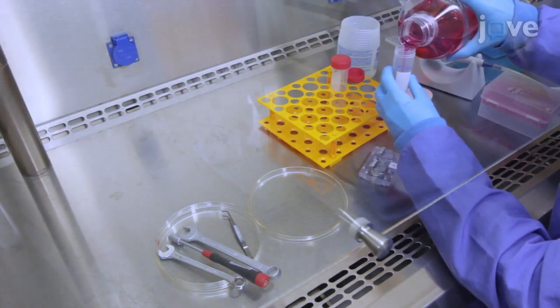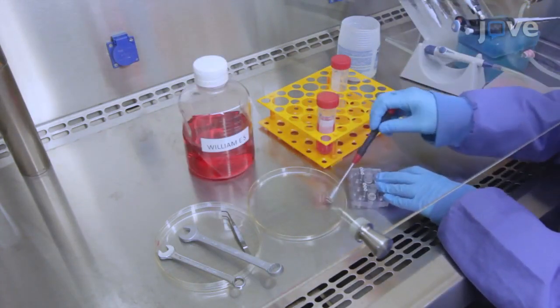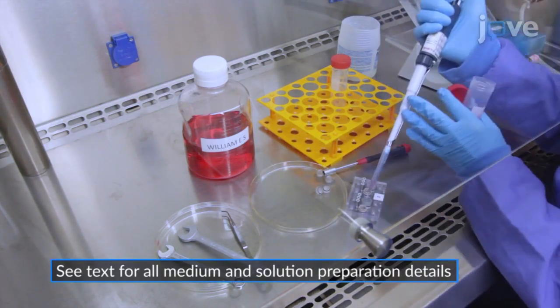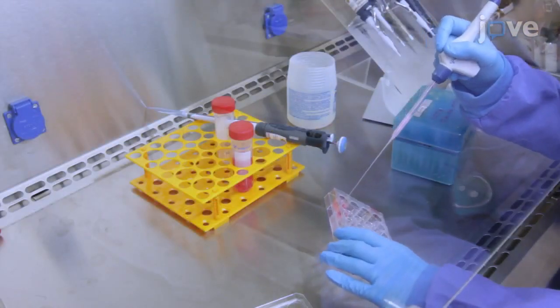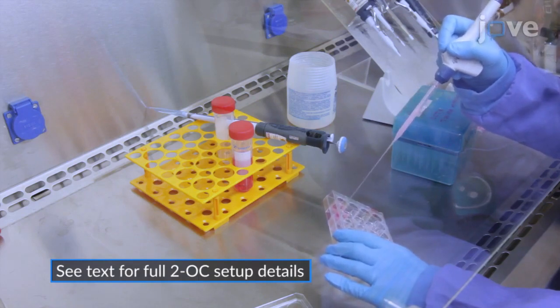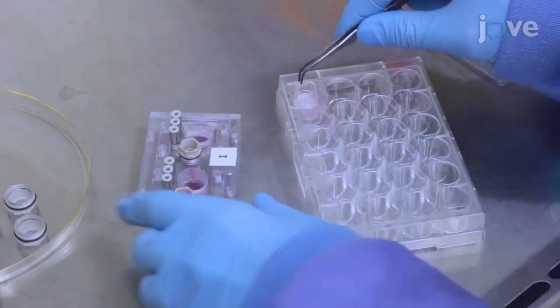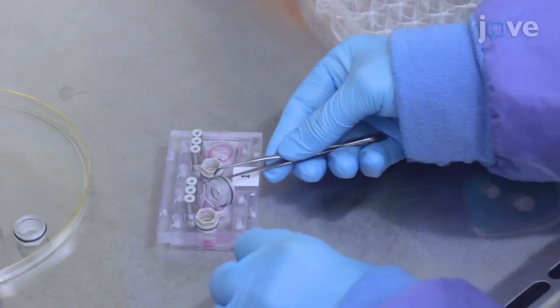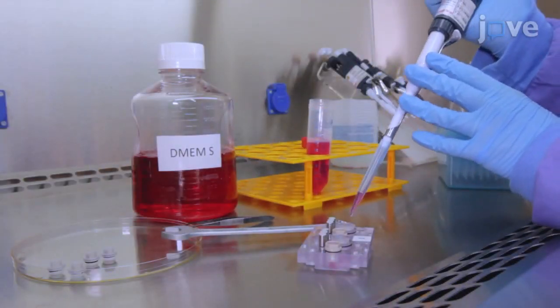24 hours before the test substance administration, split an 800 microliter aliquot of William's E medium between the larger and smaller compartments of the two-organ chip, and aspirate the basolateral and apical medium from each intestinal barrier equivalent in the prepared 24-well plates. Using sterile forceps, integrate one insert per two-organ chip circuit into the larger compartment, and add 200 microliters of DMEM to the apical side.